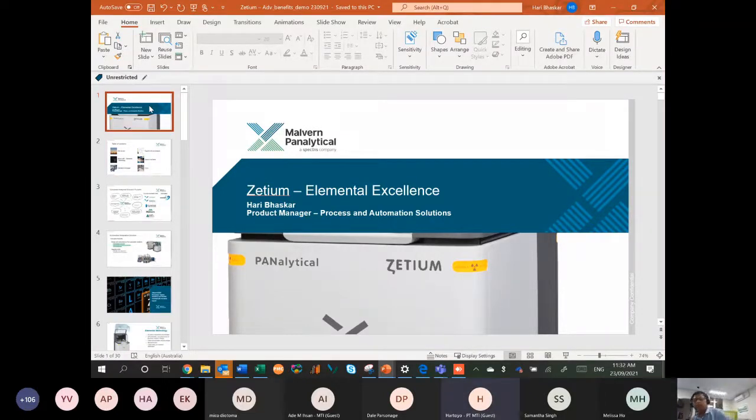Okay. So is there any impact on the machine? That's the first question. And the second question is, is there any sample verification to check the instrument stability? Okay. Let me address both the questions one by one.